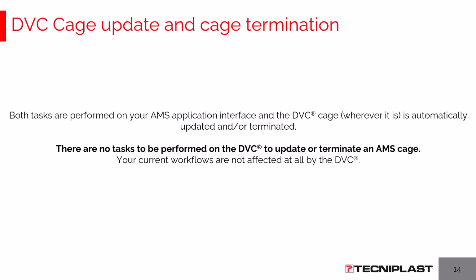Also in this case, we strongly believe that thanks to the integration, this is a major milestone achieved to simplify and make easy the interaction with the DVC. So this is the end of the first preferred workflow with the AMS integrated. You didn't see at all any DVC operator interface, any laptop. Christian, as a special guest in the video, simply worked at rack level in front of the DVC master and in front of the changing station while registering cages. Very, very straightforward.